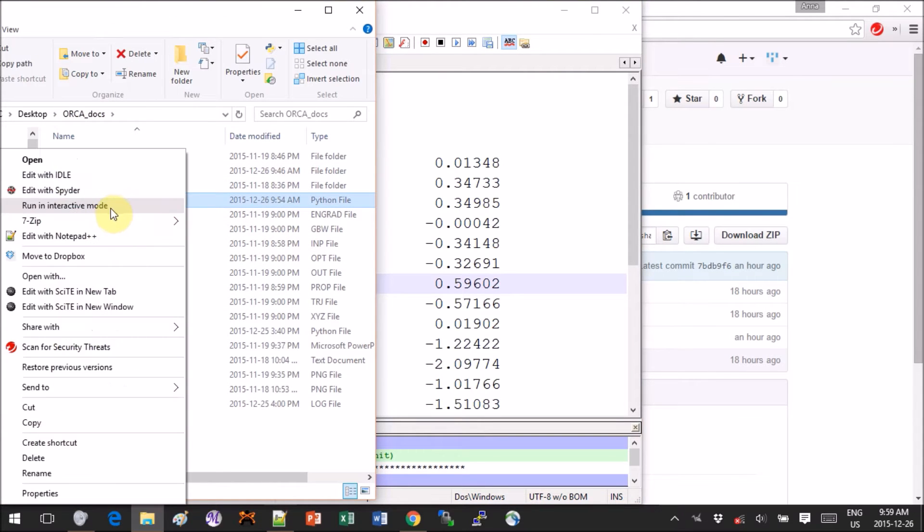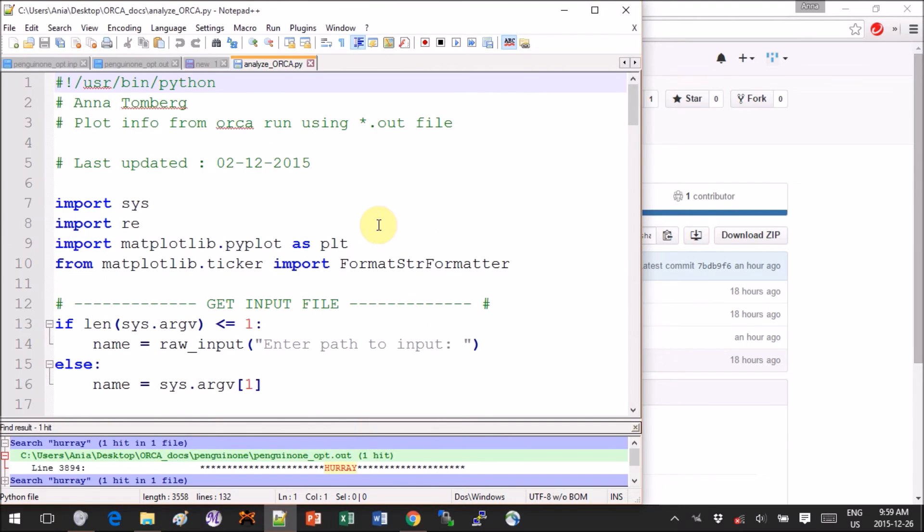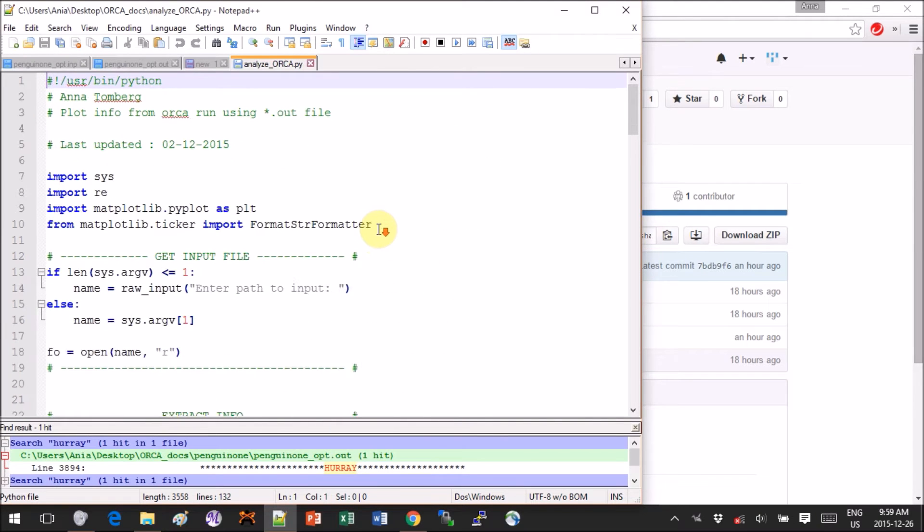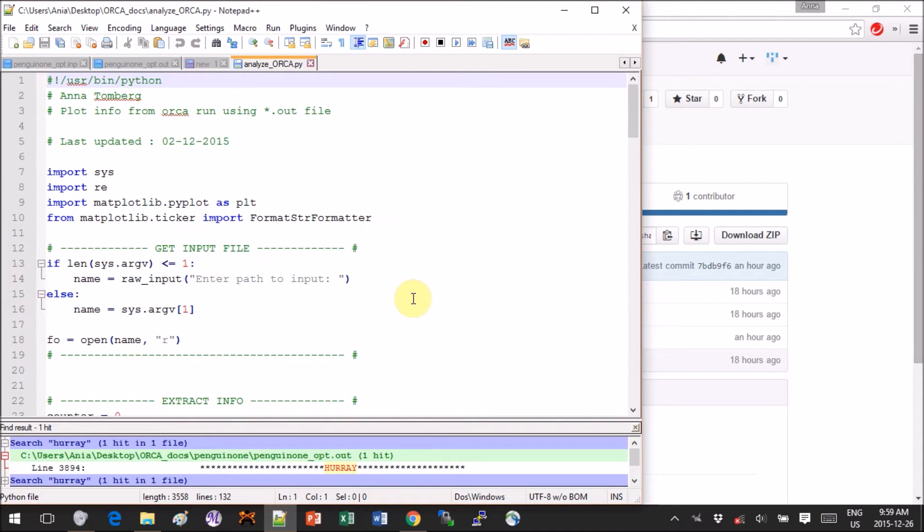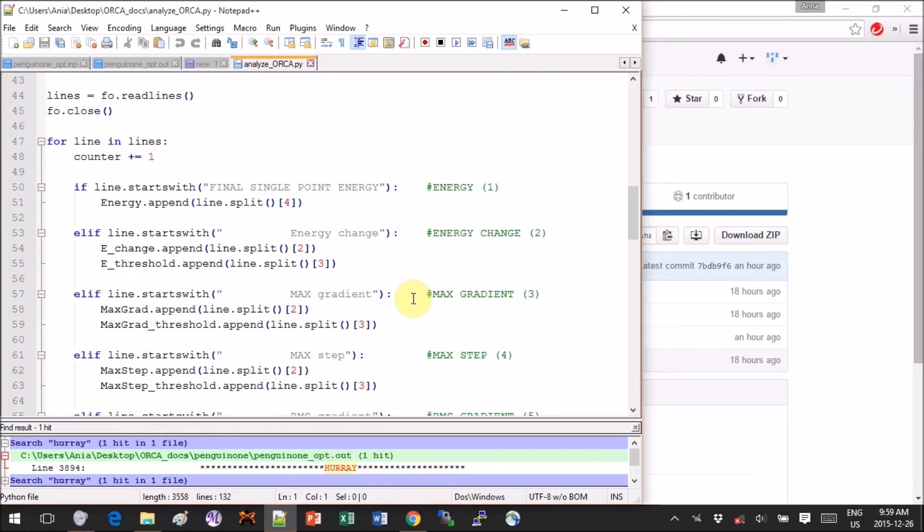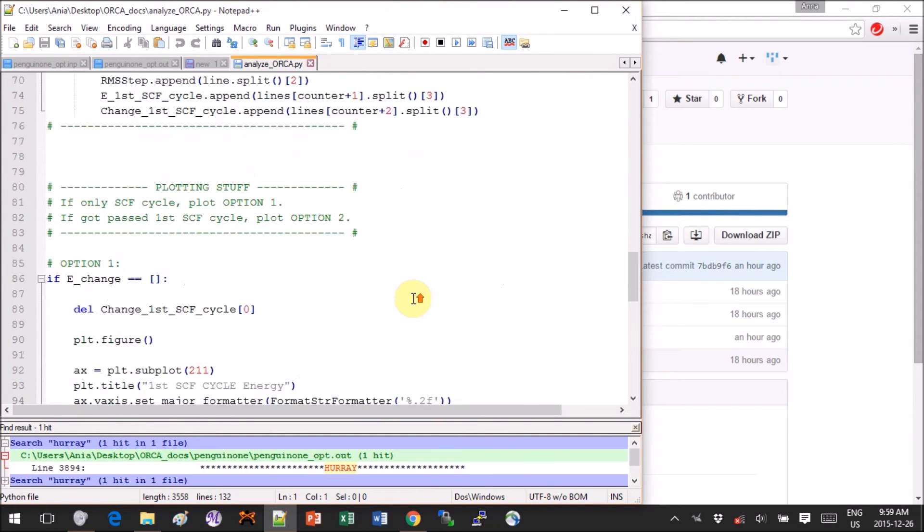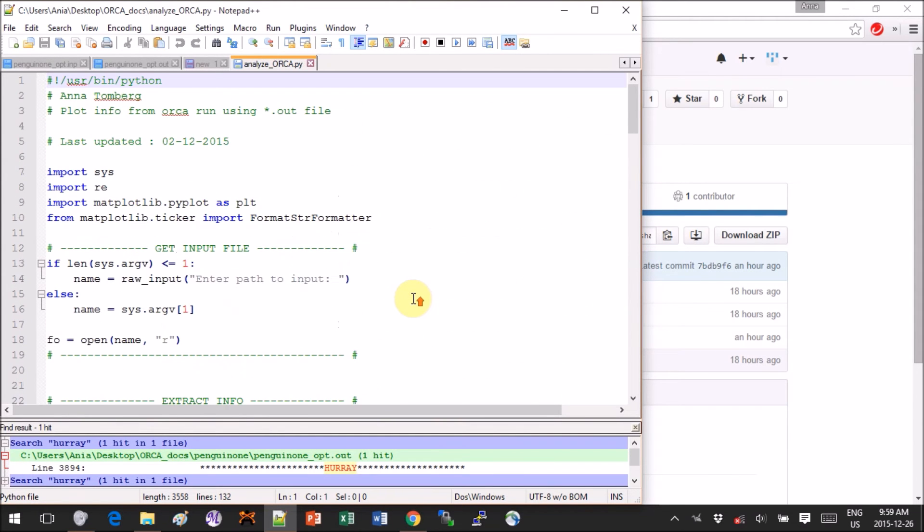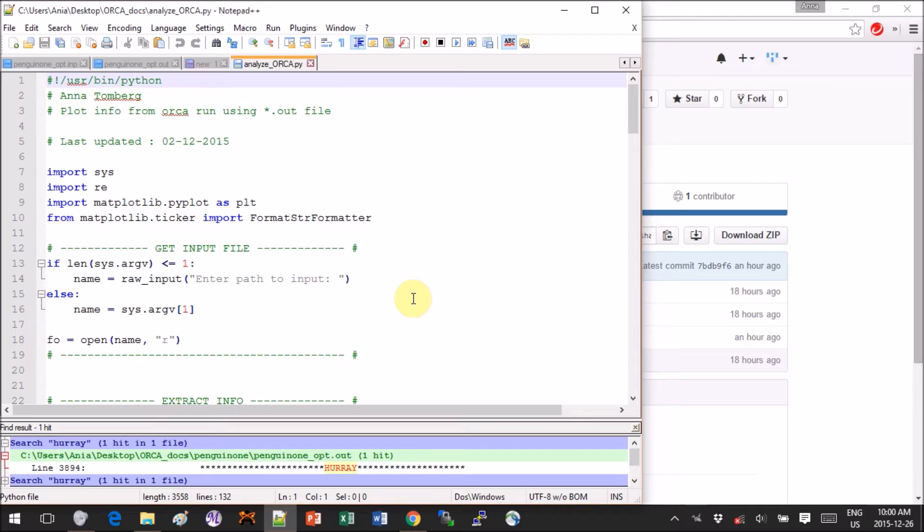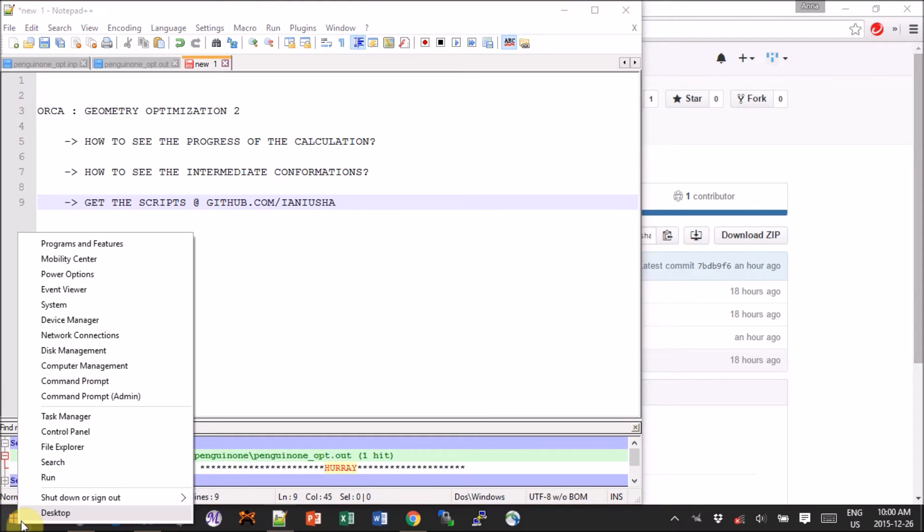Once you download it and you give it the extension dot py, you will see something like this. You do need Python on your computer, but most of the recent ones at least have at least Python 2.7, so you're probably good to go. If not, you'll have to download it.